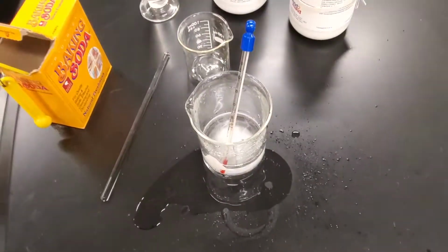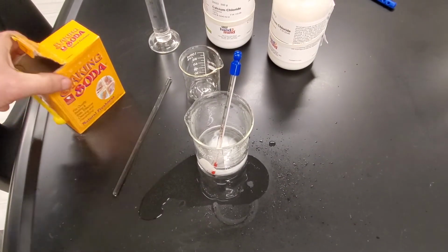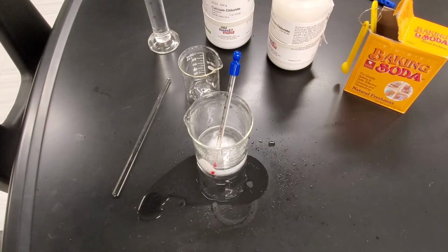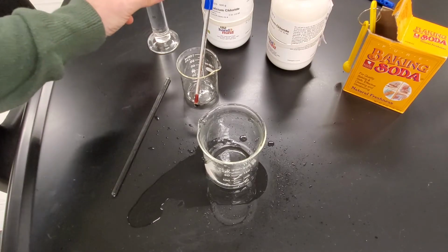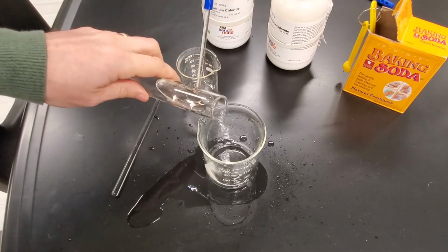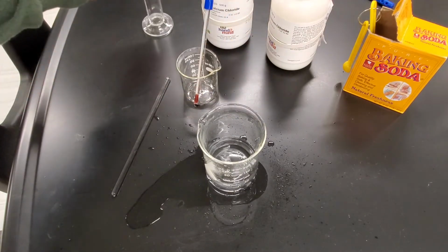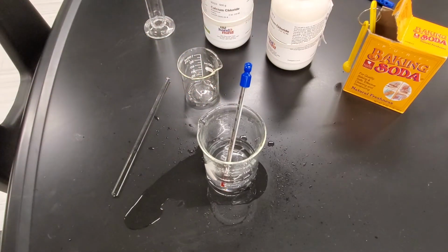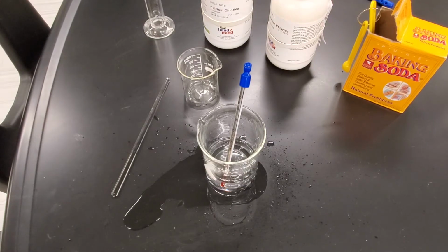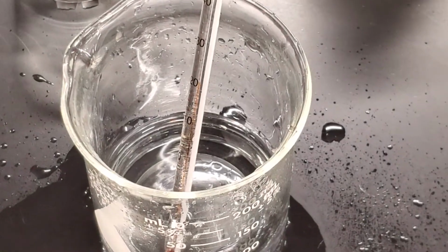All right, so at this point, I'm going to clean up my area, and then we are going to do the next combination. This time we will not be using vinegar. All right, time for our third mix. This time we will be using 50 milliliters of water that we measured out in our graduated cylinder. Again, we need to measure the temperature. We put the thermometer in there and we will give it 1 minute. And we'll zoom in on that so that you can more accurately see what the temperature of the water is.